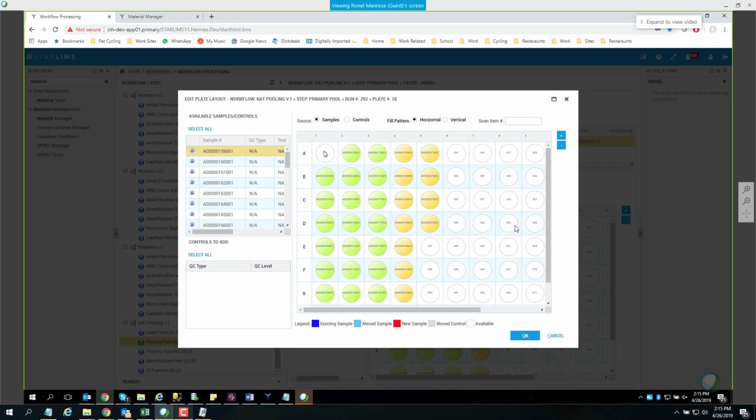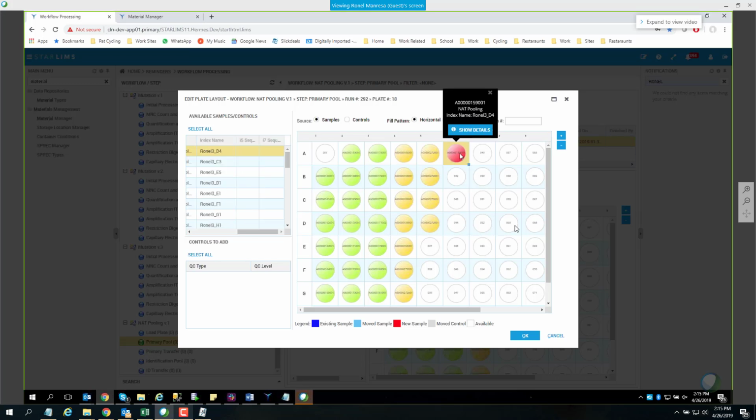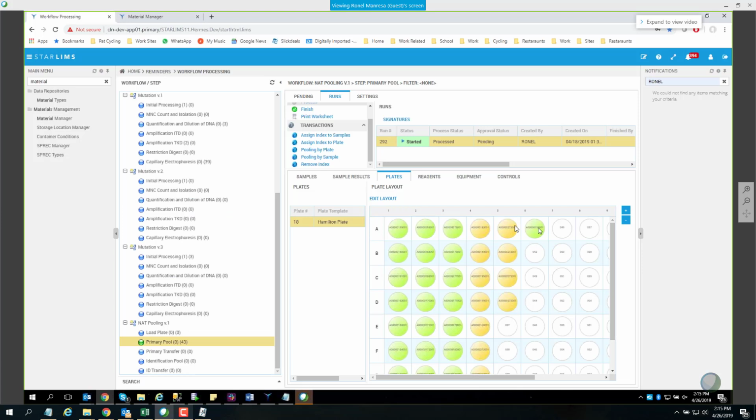It clears it. Here you can see the samples with indexes. And the indexes are in here too. And then when you drag them, they maintain the index. You can reset and rearrange things as you will. And now it's saving and getting the new index.